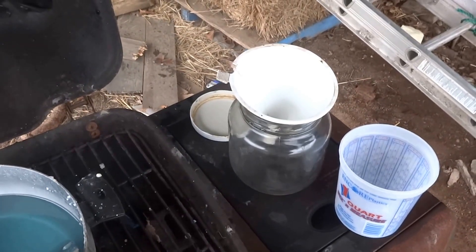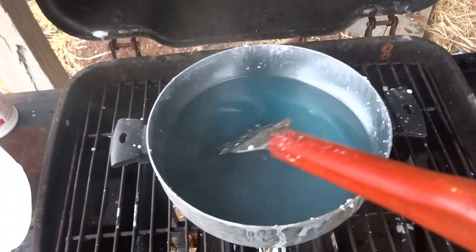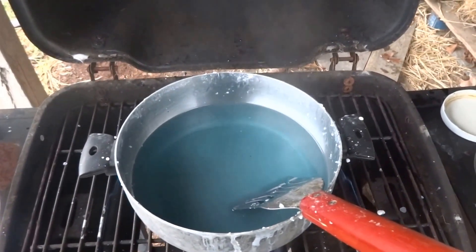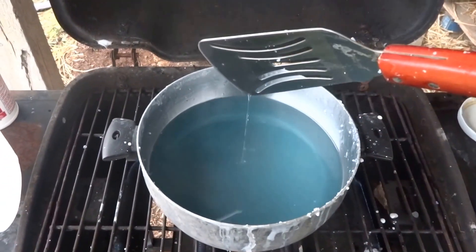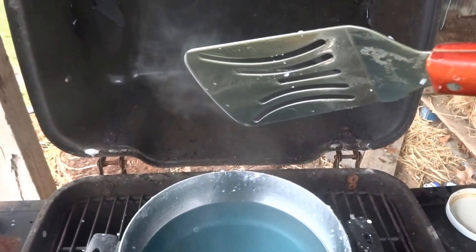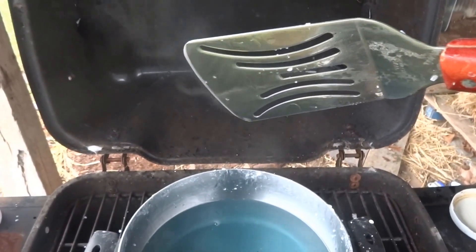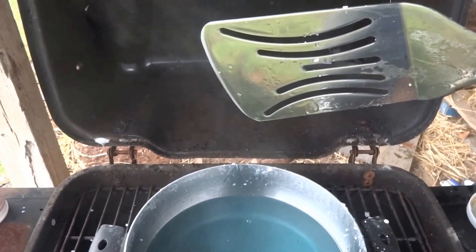I'm gonna finish this up and then pour the mixture into my jar and I'll be done. I just gotta let this cook a little bit longer, bring it up to a boil, and once it starts solidifying on the end of my utensil, I'll know that it is ready. Alright, this is Jay signing off — later!